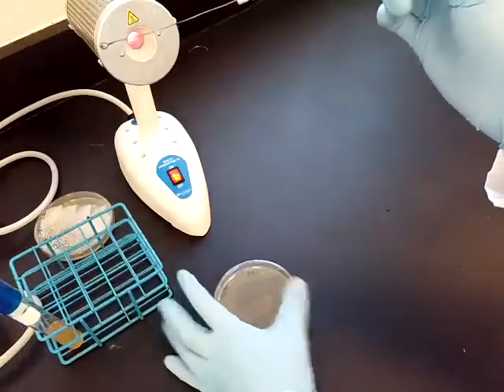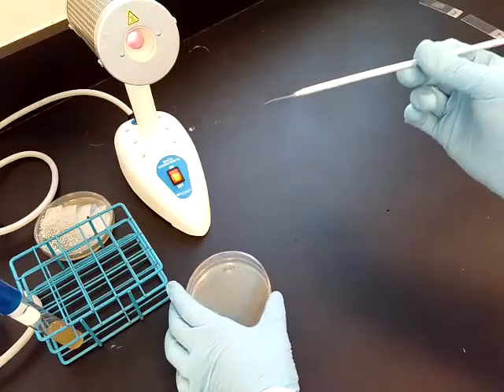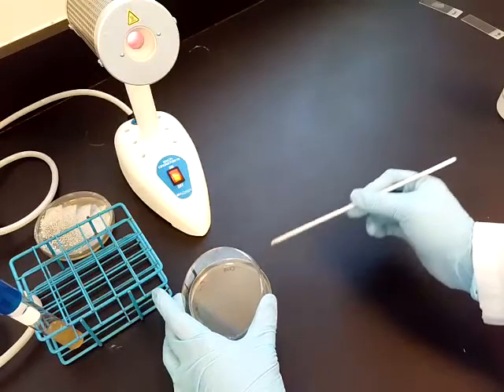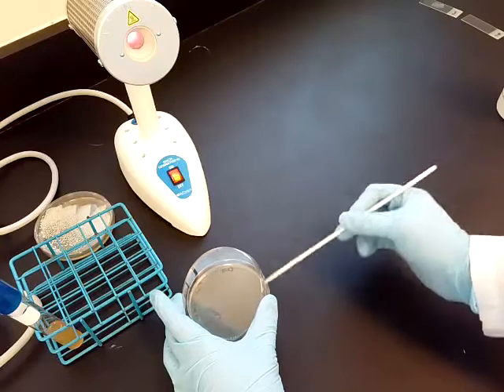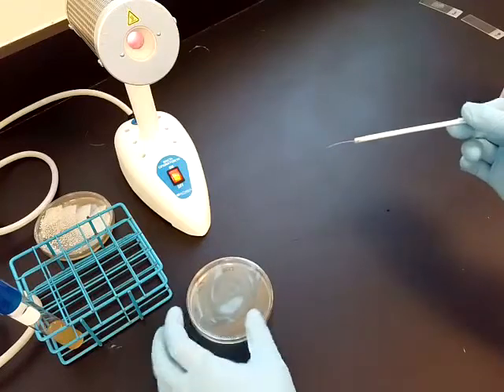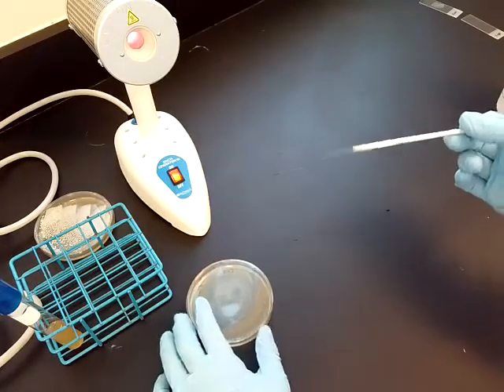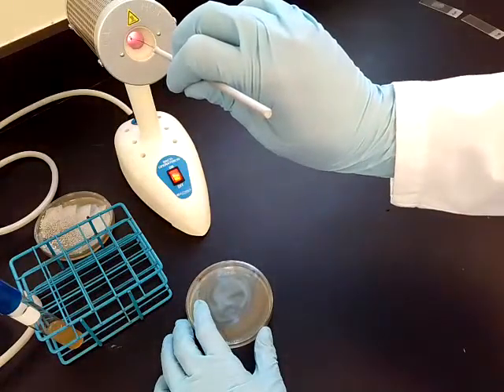Then I'm going to transfer bacteria to the original section on the plate. So I'm going to just lift up the lid slightly, and I'm going to smear it in one section of the plate. Some people like to physically draw quadrants on the bottom of their plate. I like to just rub it in sectors along the edge. So now I'm going to flame sterilize again.